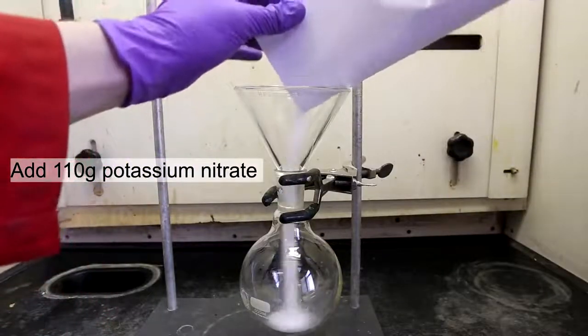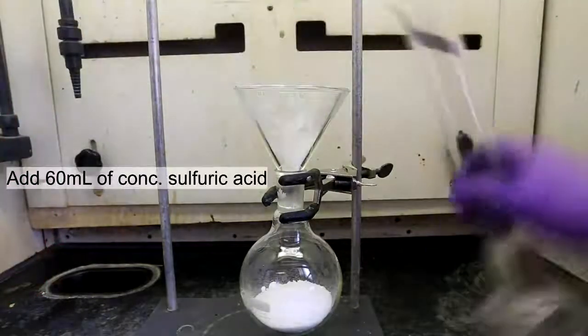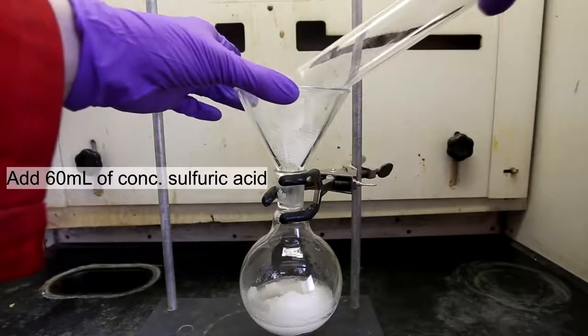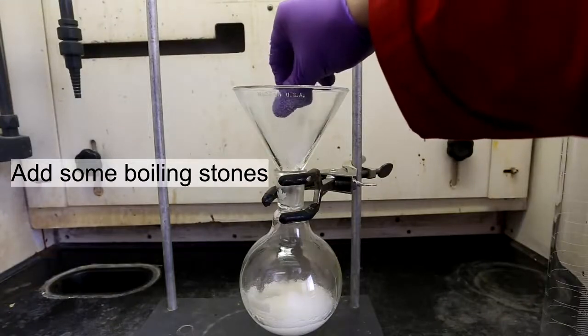First, add about 110 grams of potassium nitrate to a round bottom flask. Next, add 60 milliliters of concentrated sulfuric acid to the potassium nitrate in the round bottom. And finally, add some boiling stones to prevent bumping.